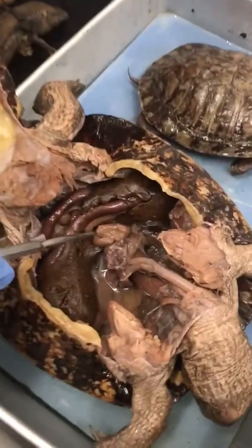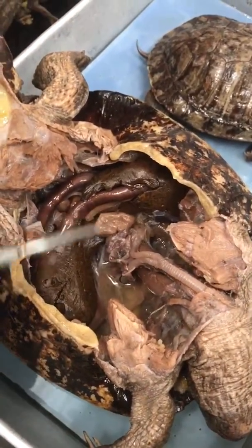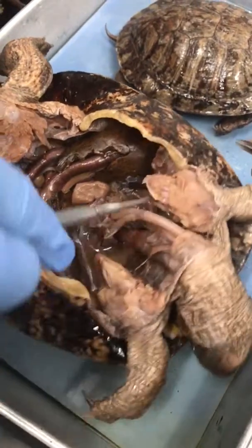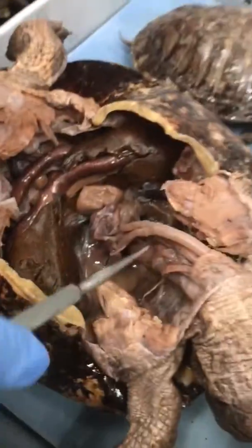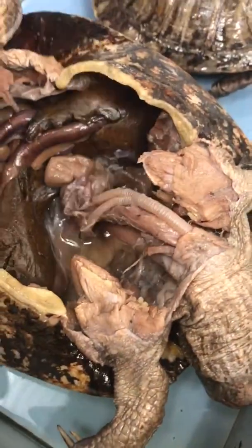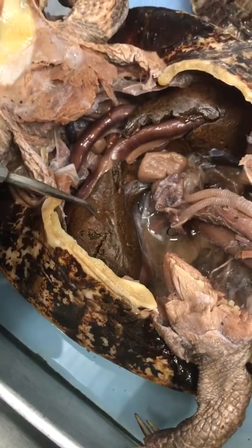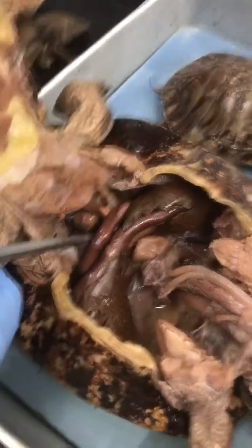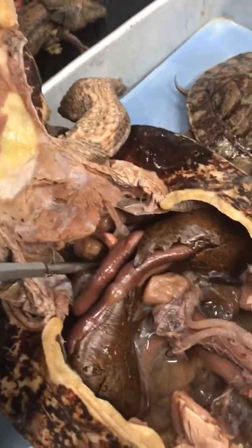Okay, so that right there, that's going to be the heart. Here, the one that's like segmented, that's the trachea. And then behind the trachea, if I can pull it right there, that's going to be the esophagus. This brown dark spot, that's the liver. And then down here, that's the small intestine.